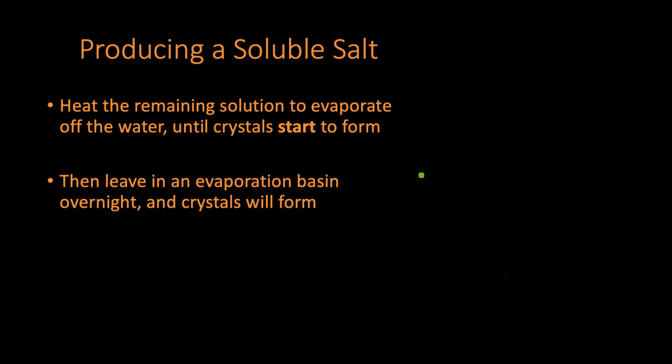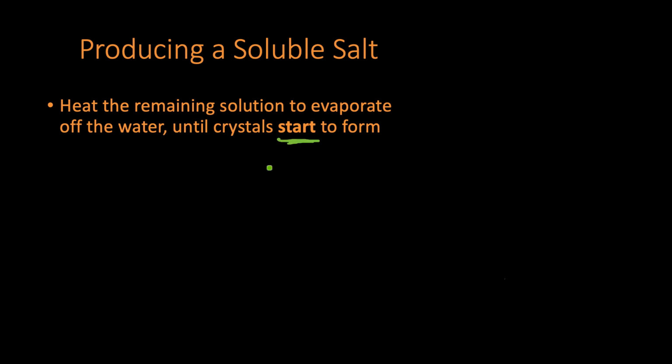And so perfect. One thing to mention is that some salts, right? For example, sodium chloride, table salt, you wouldn't get this part. You wouldn't actually have crystals start to form when you still had some water left, right? Other ones you do. So if you don't get crystals forming when there's still water left, then you just heat until all the water's gone, okay? But any salts which can form a hydrated salt, as we call it, once most of the water's gone, crystals start to form and then you stop, right? And then you would form the hydrated crystals as a result. Okay? So that is basically it.